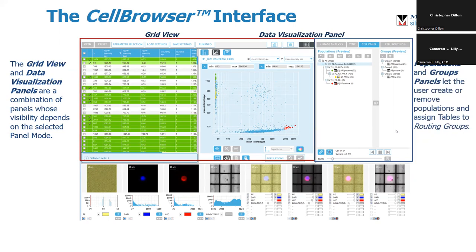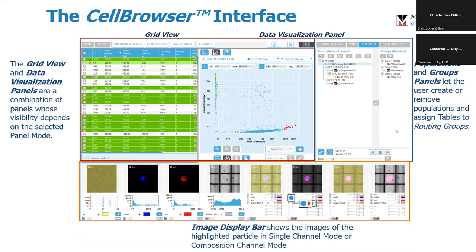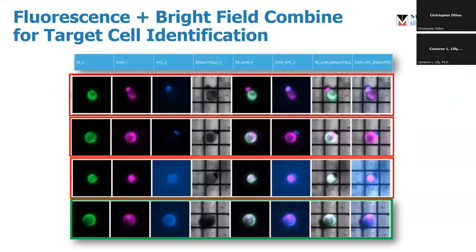This is what we call the populations and groups panel — really where we tell the software what cells we're interested in and how to get them out. Uniquely, upstream of any of this, we can actually look at all of the channels collected and make sure we're getting the cells we want before we go to isolation. This is really useful because cell suspensions are messy. Looking at these examples from the instrument itself: the top three have cells in them, but one may have a second cell, one has APC staining debris on the surface, and one has a dark occlusion visible in bright field — these would not be good candidates for recovery. However, down here we see a nice, healthy, round single cell all by itself — a perfect candidate for single-cell recovery to minimize background.